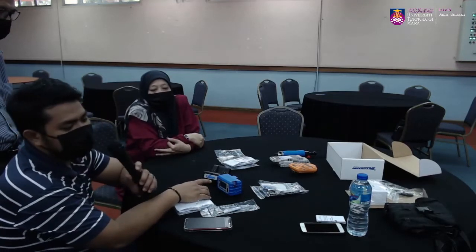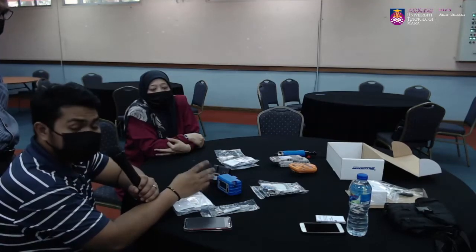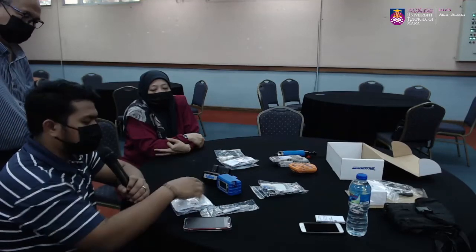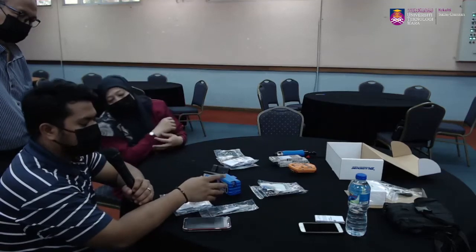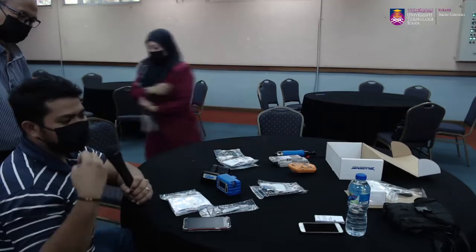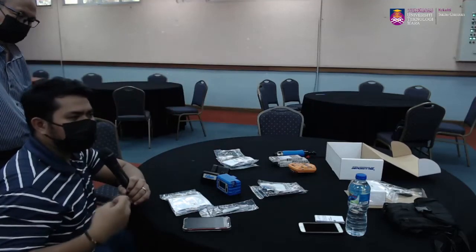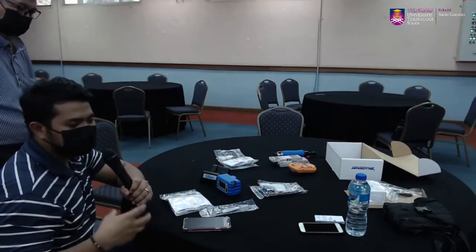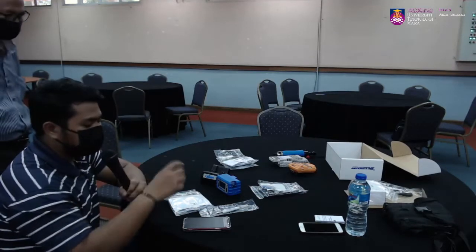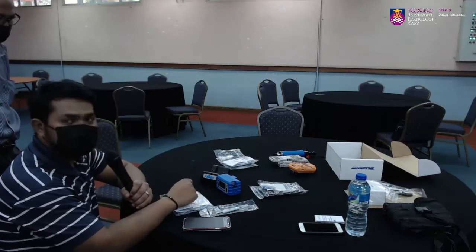So dia akan try and reset balik for 10 times. For every 3 minutes dia akan stop. Dia akan try to push the pump sampai 1000 cc per minute. Kalau dia tak dapat lagi, dia akan stop jap. Sebab usually when the user dia tak perasan, dia tengok pump bunyi kadang-kadang kuat, kadang-kadang slow, kuat, slow. Means that dia tengah try and push balik untuk dapatkan that 1000 cc per minute.